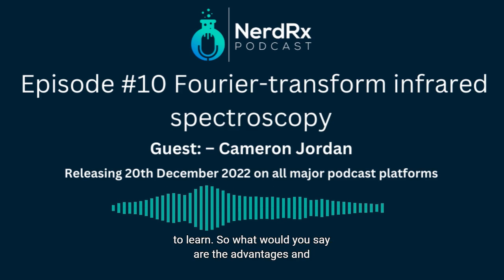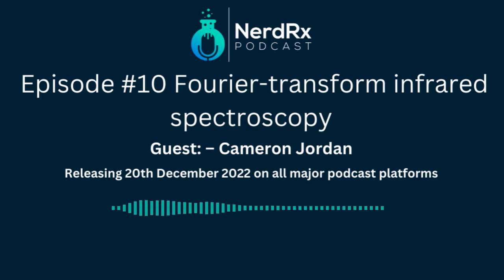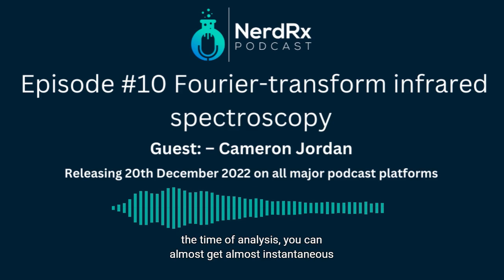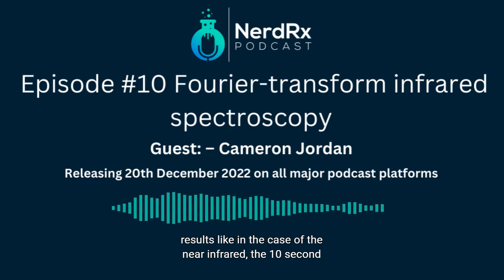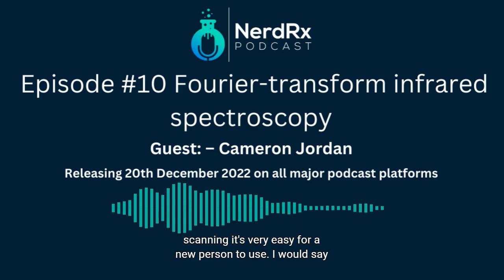Okay, it sounds like an easy technique to learn. So, what would you say are the advantages and disadvantages of FTIR? I would say an advantage of FTIR is definitely the time of analysis. You can get almost instantaneous results, like in the case of the near infrared, the 10-second scanning. It's very easy for a new person to use.